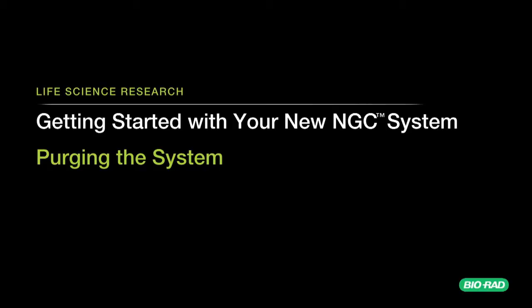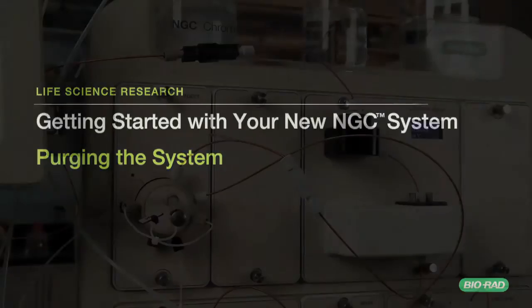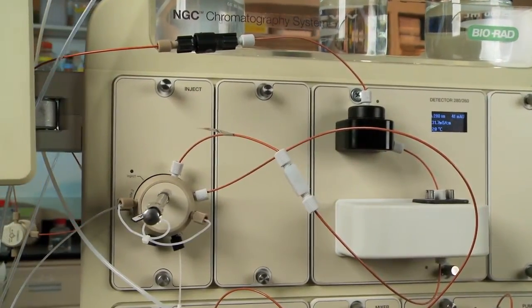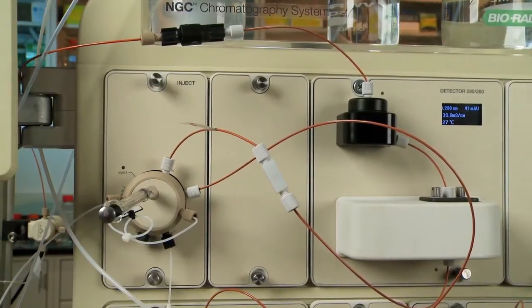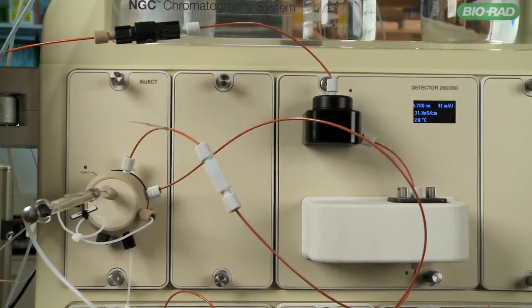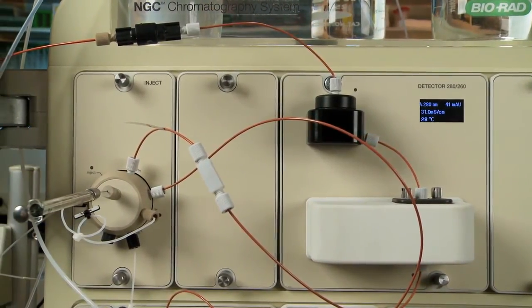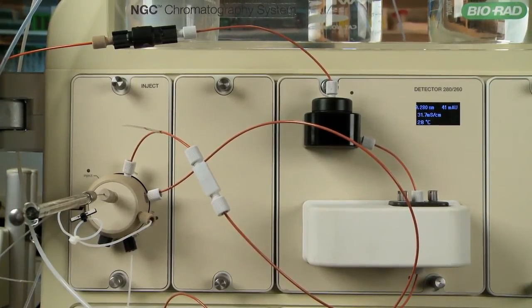This video demonstrates the two methods used for purging your NGC system. Before purging the system, be sure to take the column out of line, either by physically removing the column and replacing with a union, or, if using a column valve, make sure it is in the bypass position.